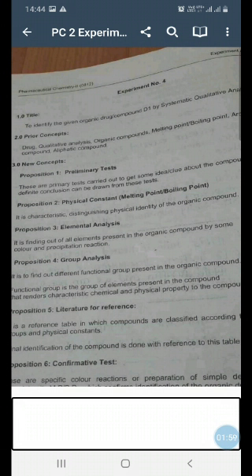Now during this sodium fusion, what will happen? The inorganic sodium salts of organic compounds are formed. That means in this test we are converting the organic compound temporarily into inorganic sodium salt, so that inorganic qualitative tests can be applied on them, because it is far easier to detect nitrogen, sulfur and halogens by inorganic tests rather than going in the organic way.